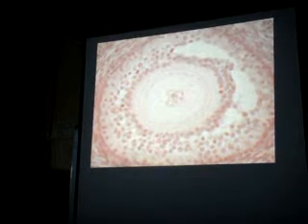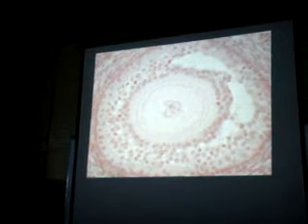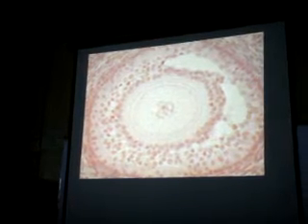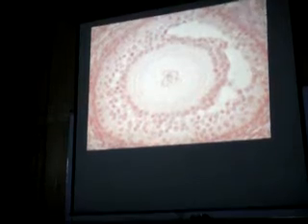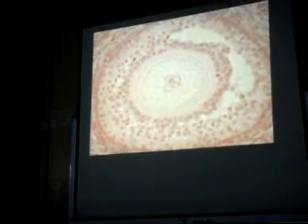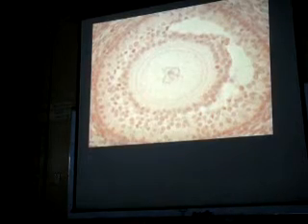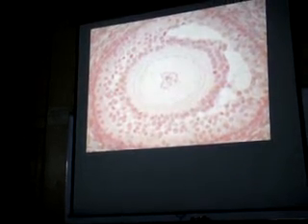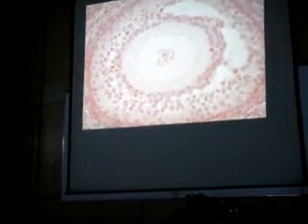So you have to imagine that there's a cell membrane separating the ovum from the other cells to which the ovum is closely related. And you have to imagine that there's a nuclear membrane in between the nucleoplasm and the cytoplasm. That's all that you need to know in the slide of the ovum. So you need not identify that it's the ovary or it's located in the ovarian cortex or stroma.